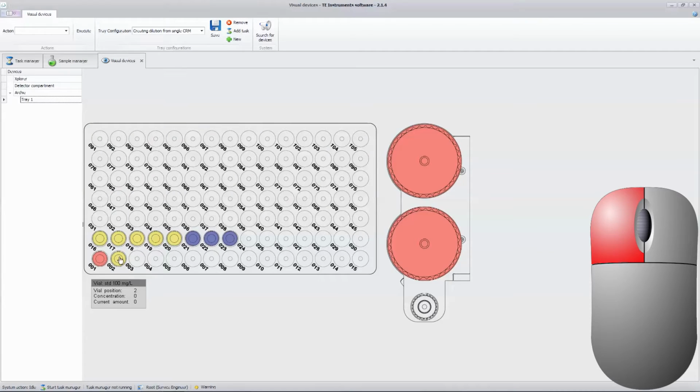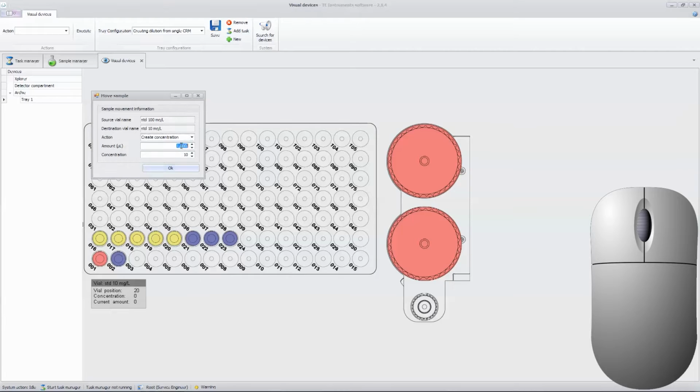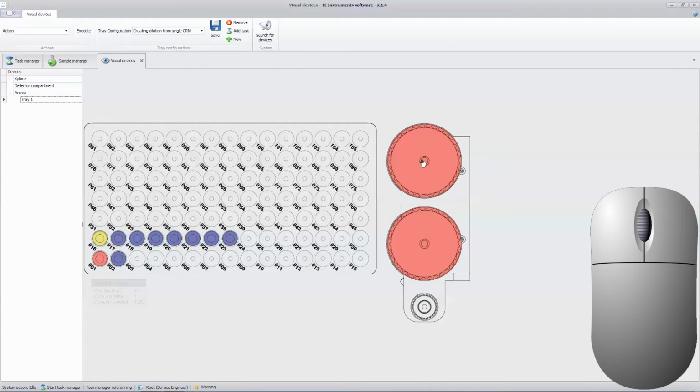Here we create the 100 ppm standard for the lower standards 1, 2.5, 5 and 10. The standard 0 must be created out of the clean wash.